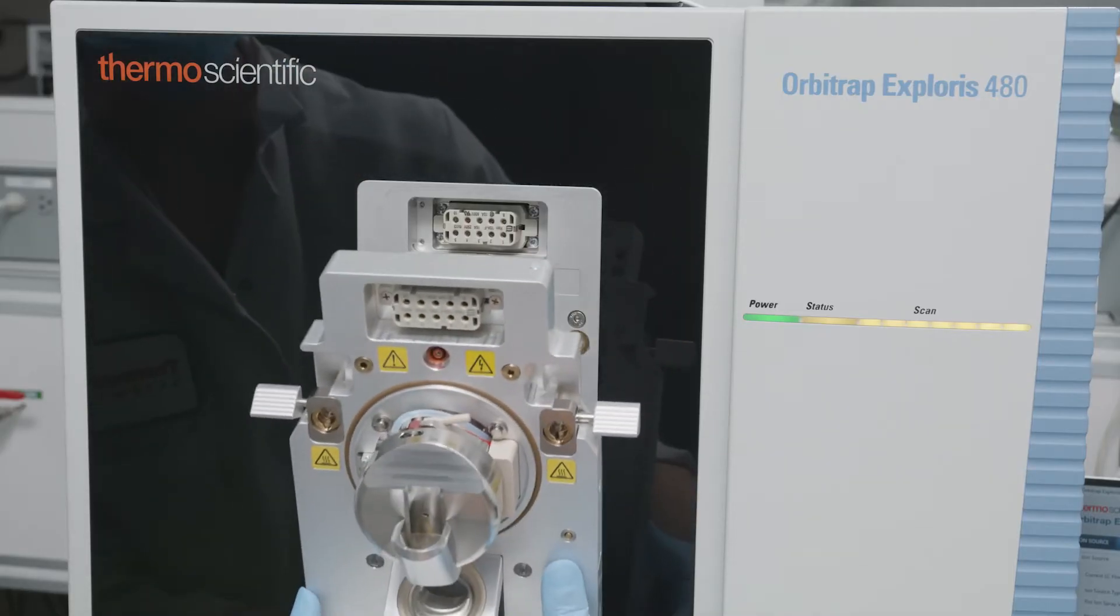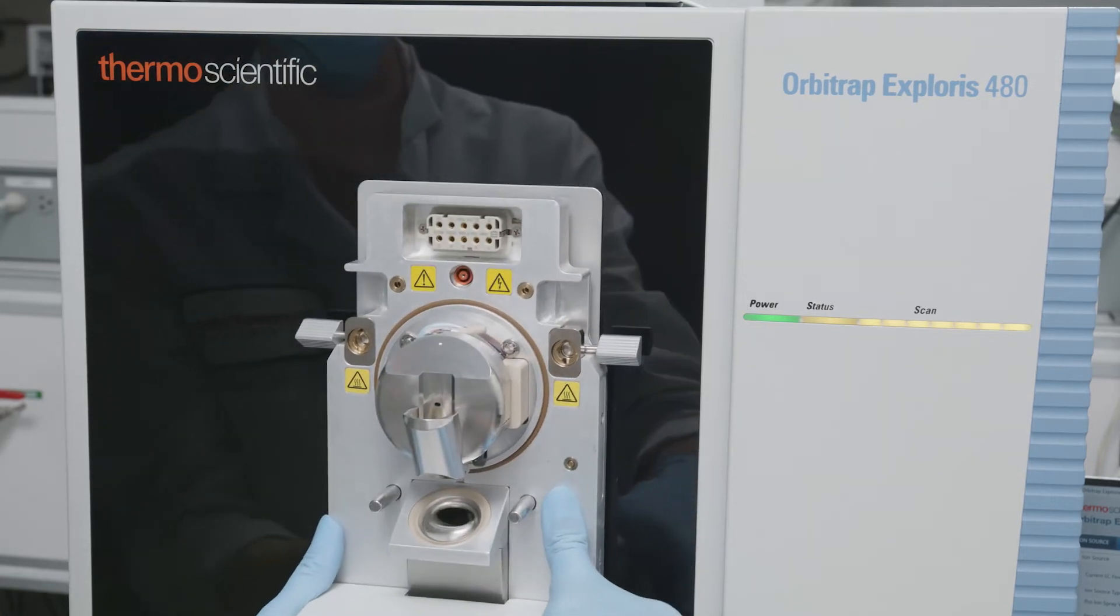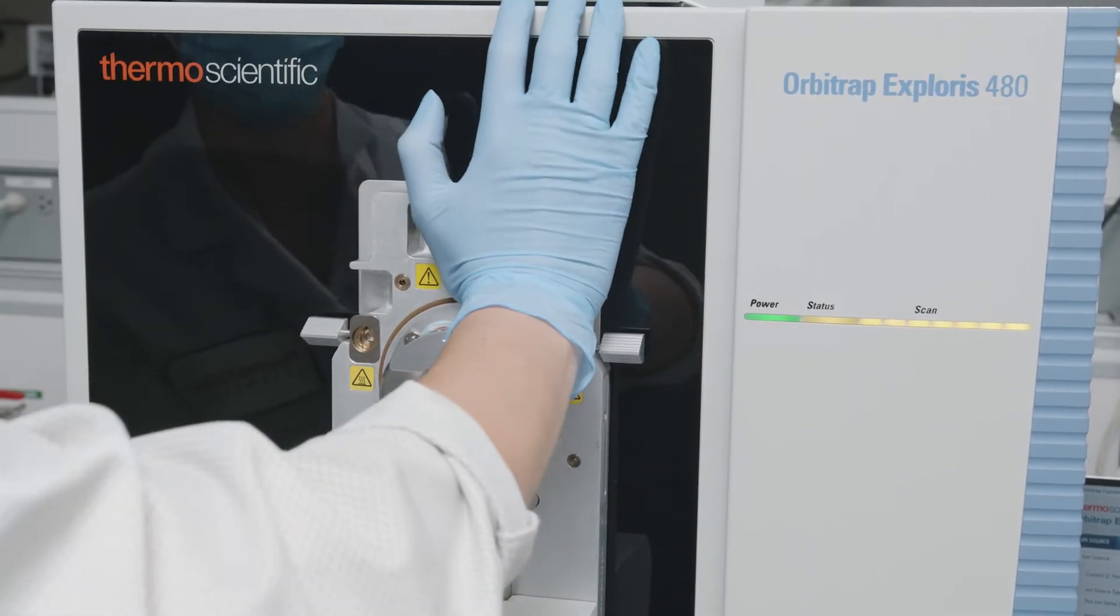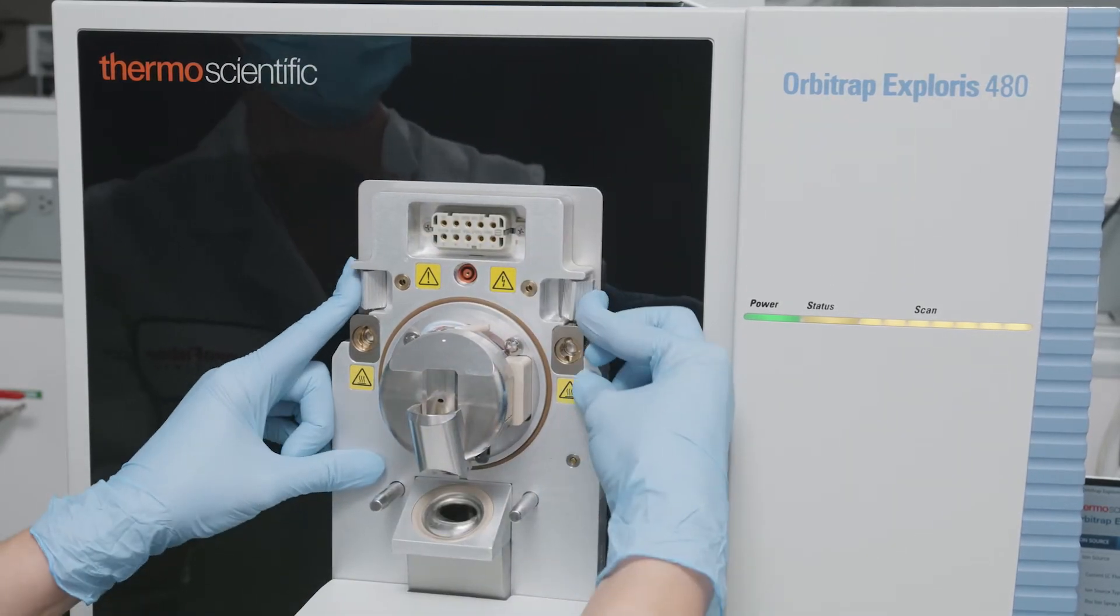Install the FAIMS housing adapter onto the front of the mass spectrometer. Push against the top and the middle part of the housing adapter to make it sit flush with the instrument.